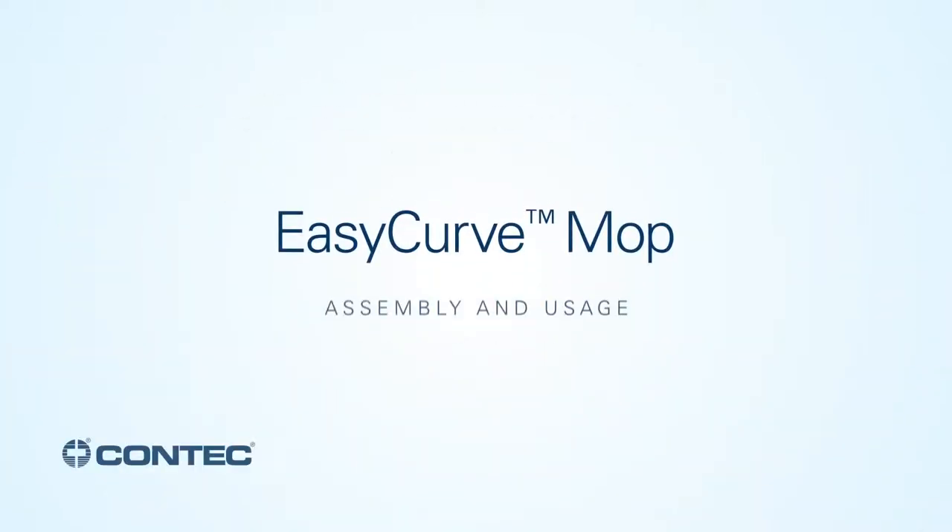This installation guide is compatible with both sealed and non-sealed edge EasyCurve mops.